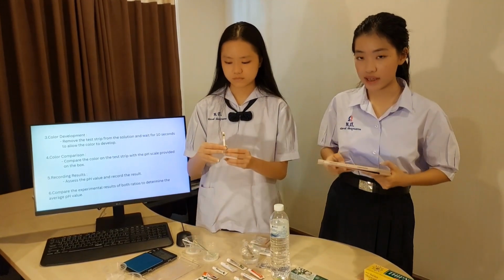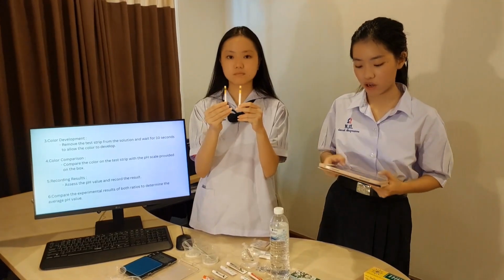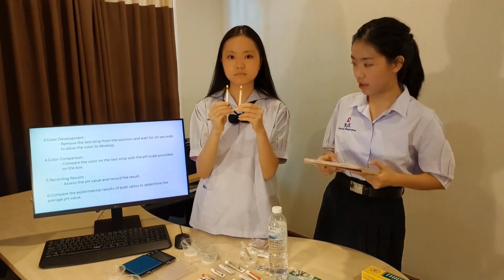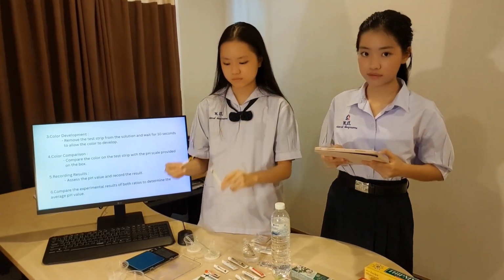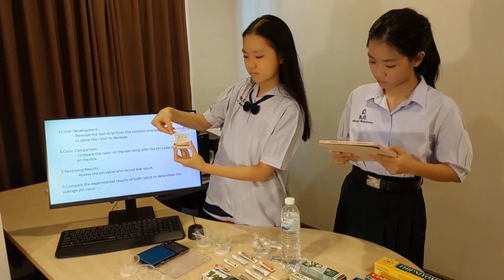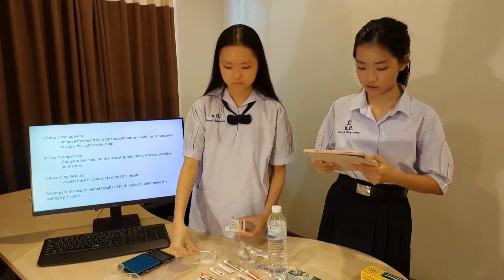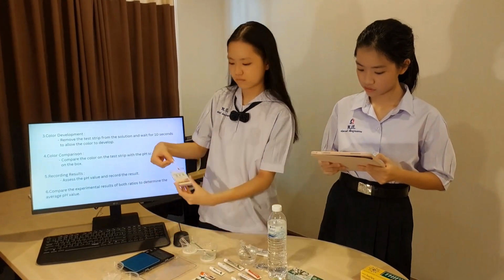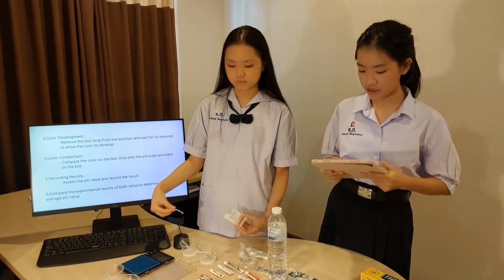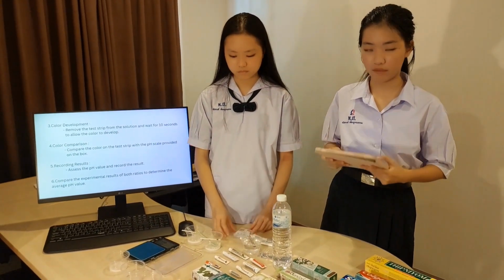After the 10 seconds, we compare the color on the test strip with the pH scale provided on the box. Assess the pH value and record the result. Compare the experimental results of both ratios to determine the average pH value.